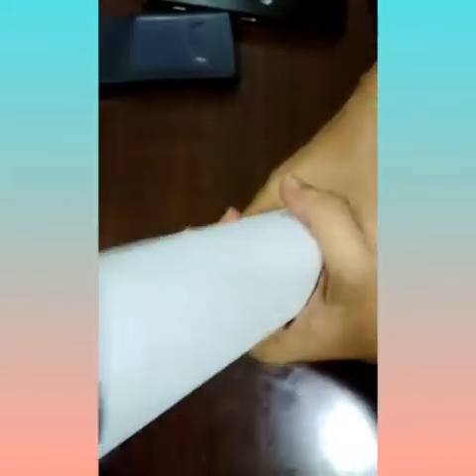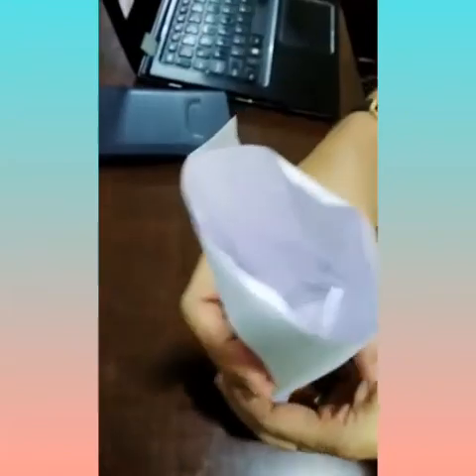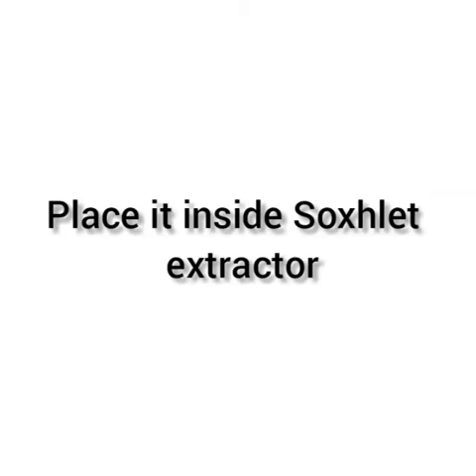I am going to give a small demonstration on how to make a thimble using an ordinary filter paper. I have taken an ordinary paper for demonstration purposes, but you can use a filter paper. Take the filter paper and roll it so that its diameter is smaller than the diameter of the Soxhlet column — it should fit inside the column. Roll it, then fold the lower portion and press it. Now this becomes a thimble wherein you can fill the extract, and the top portion can be closed in a similar way, just like making a packet.